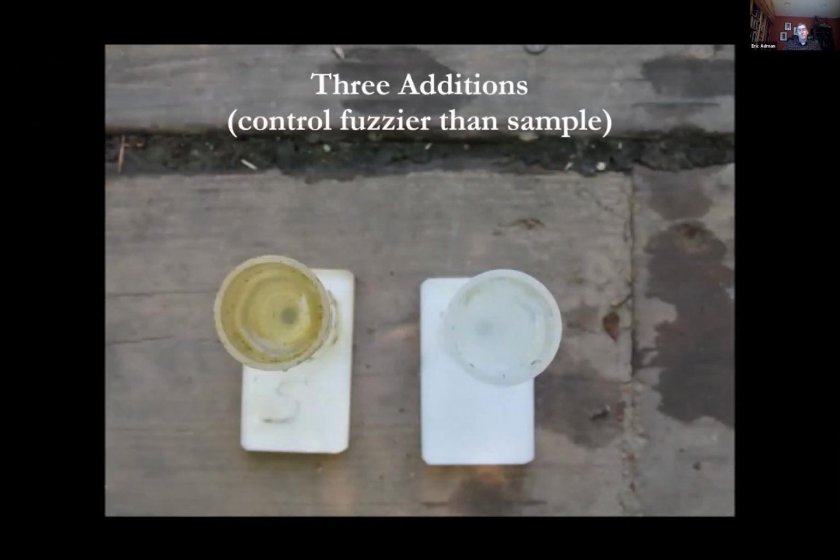Once the control dot is fuzzier than the sample, record the number of additions, not counting the last addition. For example, if just one addition of turbidity reagent makes the control column dot fuzzier than the sample column dot, record as 0 additions. In this case, 3 additions of turbidity reagent made the control column dot fuzzier than the sample column dot, so we would record it as 2 additions.